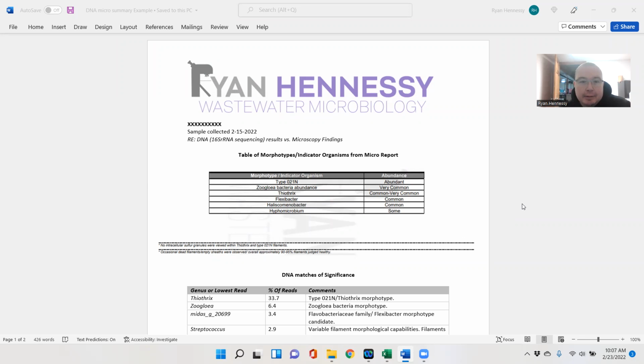In this video, I'd like to do a quick walkthrough of the DNA to micro DNA summary report. Basically, the way this works is I receive a sample, create a micro report, which is sent to the client, and I preserve the sample and send it to the DNA lab that I work with. They give me back a report showing the DNA sequencing reads, which uses 16S RNA sequencing.